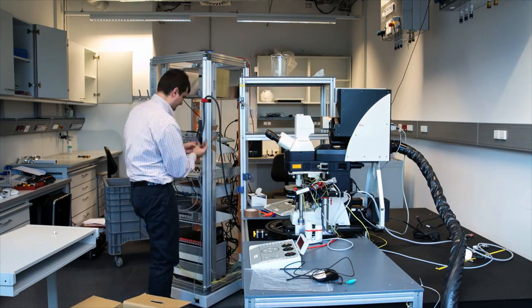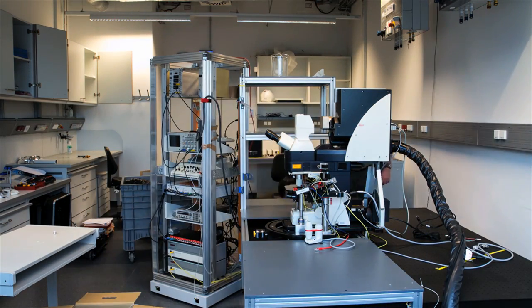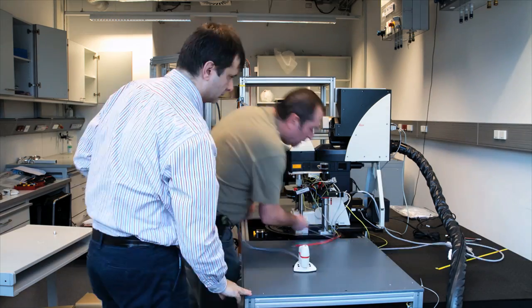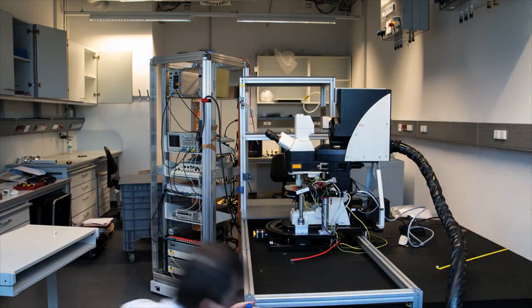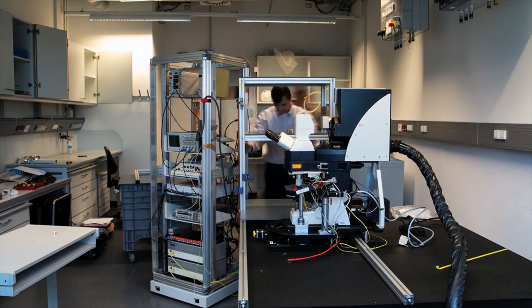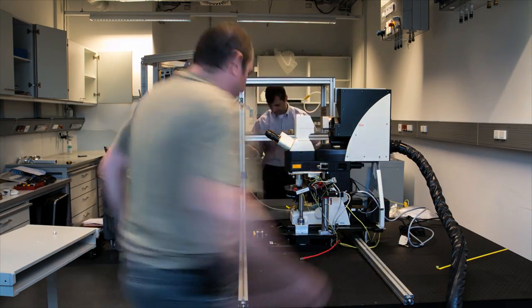But in these days of second-generation patch clamp recording and electrophysiology, obviously not only the type of experiments becomes much more complicated, but also the necessary equipment is much more complex.